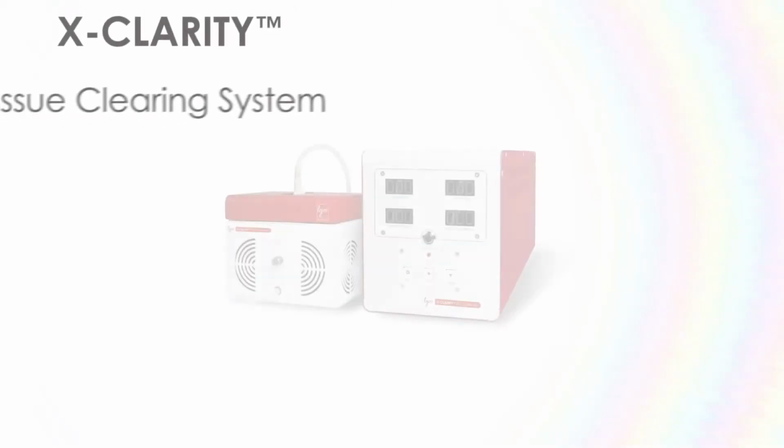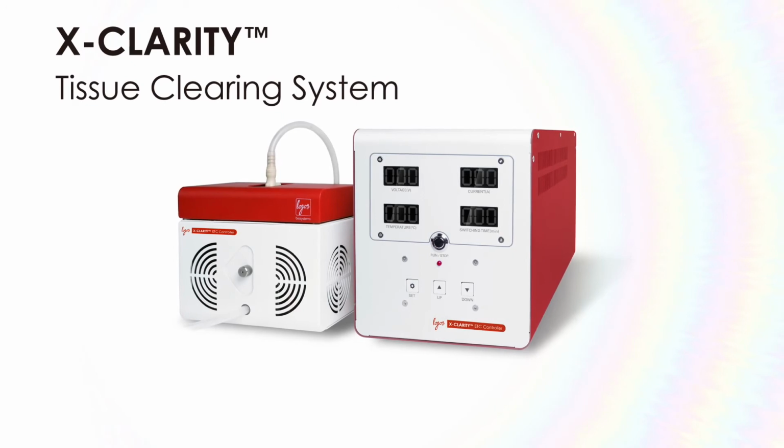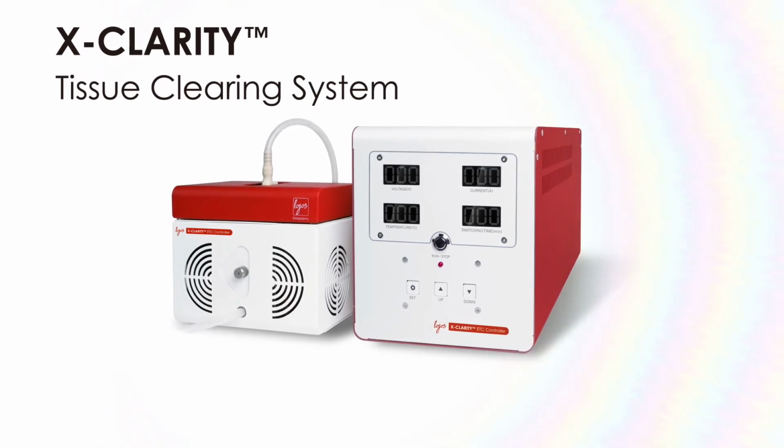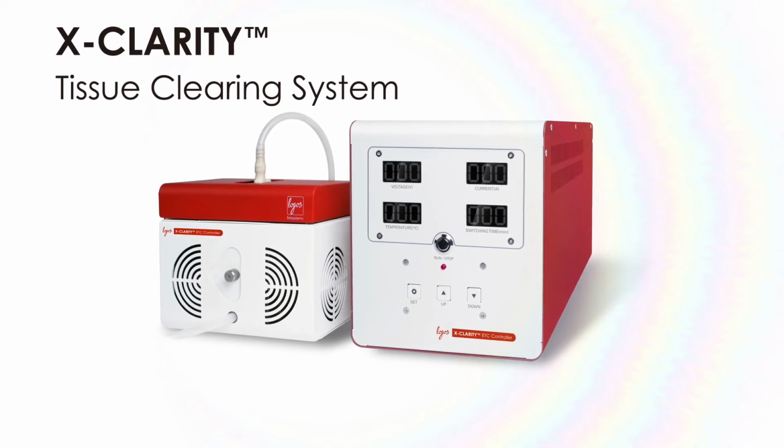To address these challenges, commercial systems for performing CLARITY are available. These systems provide an all-in-one solution that takes the guesswork and protocol development out of the process and enables researchers to clear tissue for imaging rapidly and consistently. The use of commercial systems also reduces the amount of time CLARITY requires, from up to 2 weeks for a mouse brain to now just 8 hours.